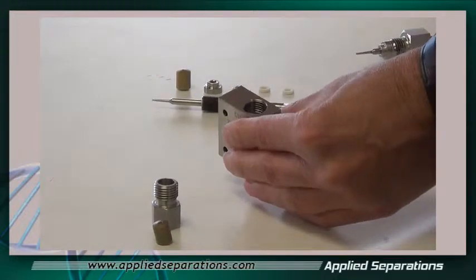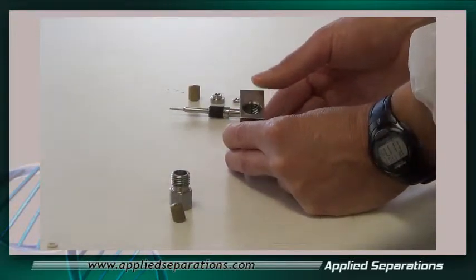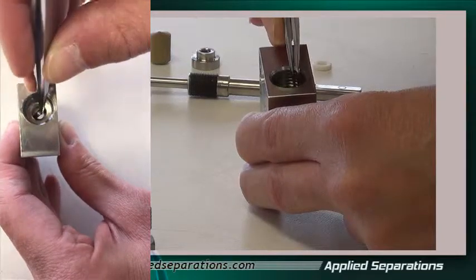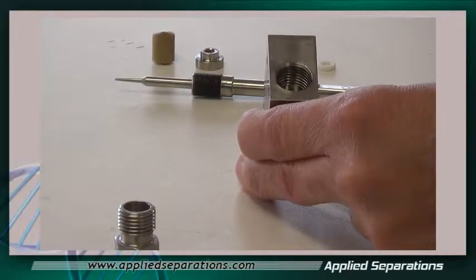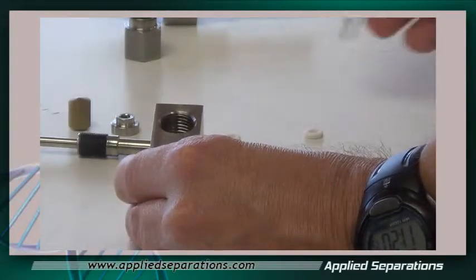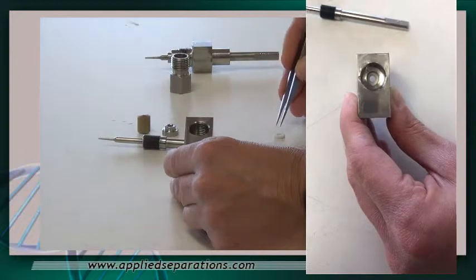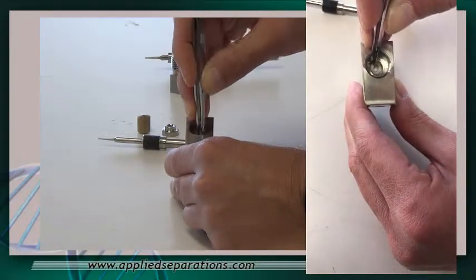Now you're ready for inserting the replacement items. The first part you want to put in is the small stainless steel washer. You can use tweezers to make the assembly go a little more quickly. Make sure that the stainless steel washer fits all the way inside that little groove. With the stainless steel washer in there, install the first small Teflon washer and make sure that seats in there. Then install the second Teflon washer and make sure that seats in there also.